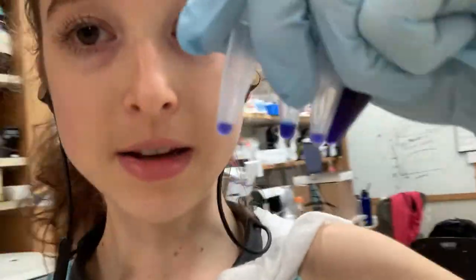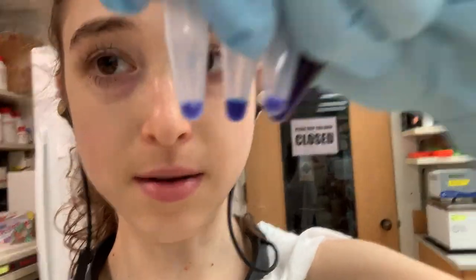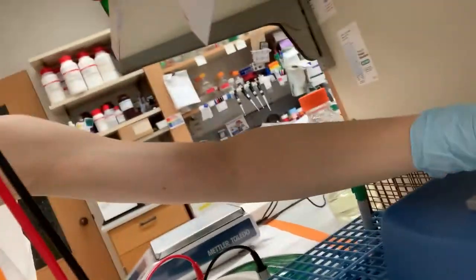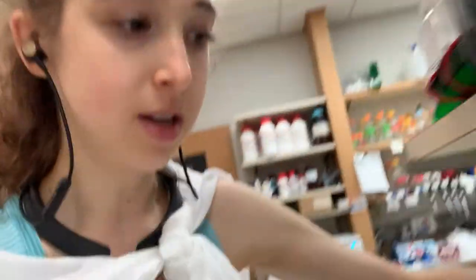In order to get the detergent to coat the proteins, we also need to give them some help from heat. After mixing the dye and the protein, I give them a quick spin in a pulse centrifuge and stick them on a sand bath. We heat them at about 95°C for a couple of minutes. This helps unfold the proteins and lets the detergent coat them all.